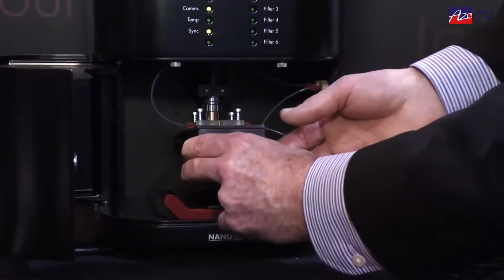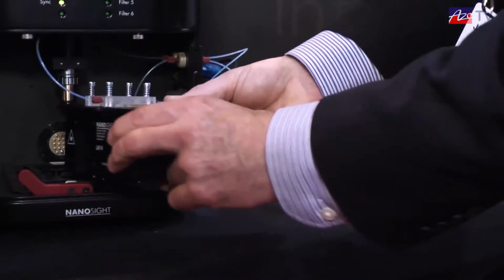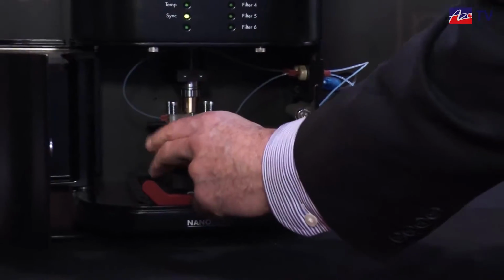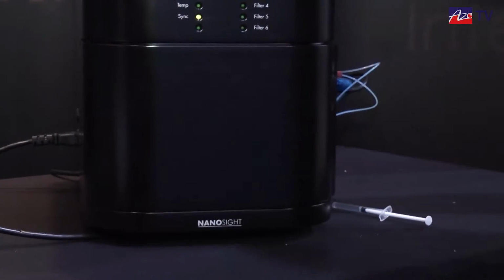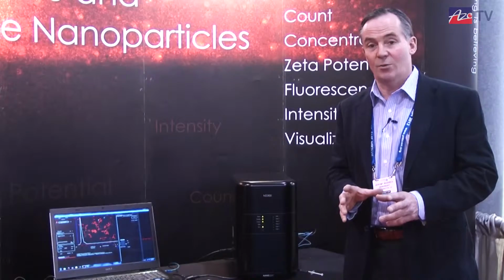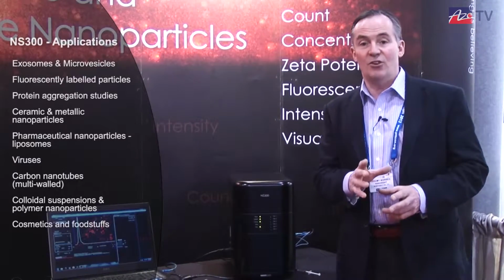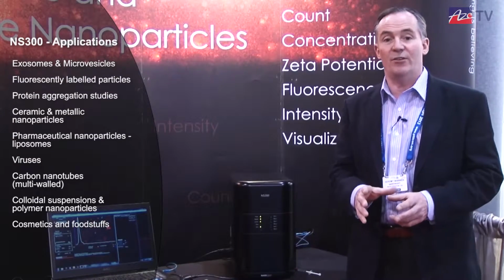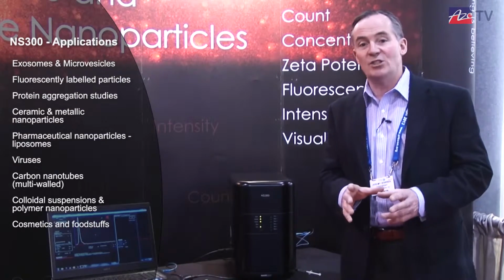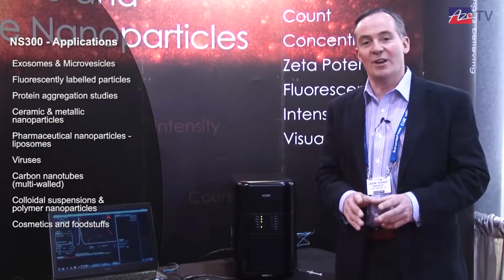Now, what we have here is the opportunity for a single laser excitation wavelength to illuminate perhaps quantum dots of a number of different wavelengths, quantum dots producing a number of different emission wavelengths, and simultaneously track several populations of particles according to their fluorescent signature. So we can differentiate, speciate, if you like, several different channels using one laser to illuminate them.